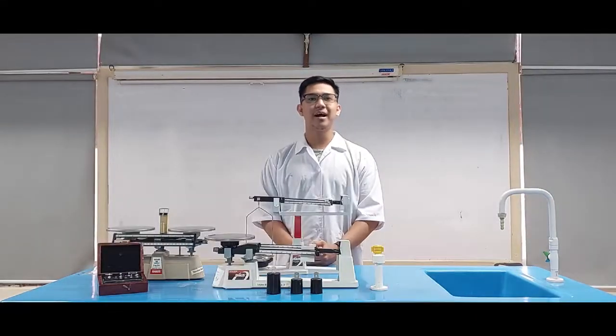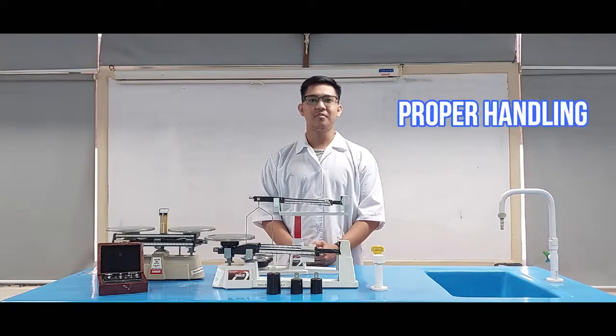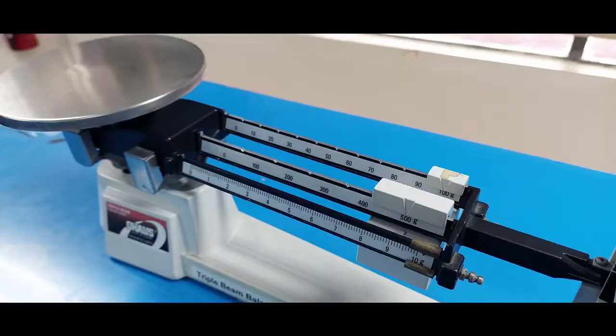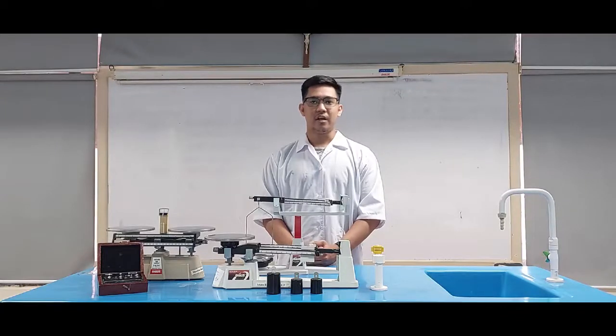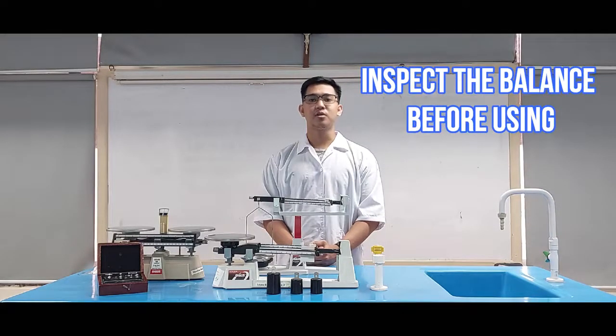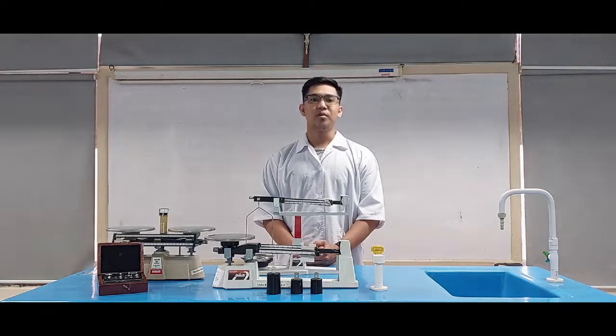When operating the balance, keep in mind the following reminders. Place the balance on a level and sturdy surface. Position it on a firm bench away from vibration and currents of air. Ensure that the pointer is at zero level. Inspect the balance before using. If there is any malfunction, do not try to fix it by yourself. Report it to your laboratory instructor or personnel immediately.